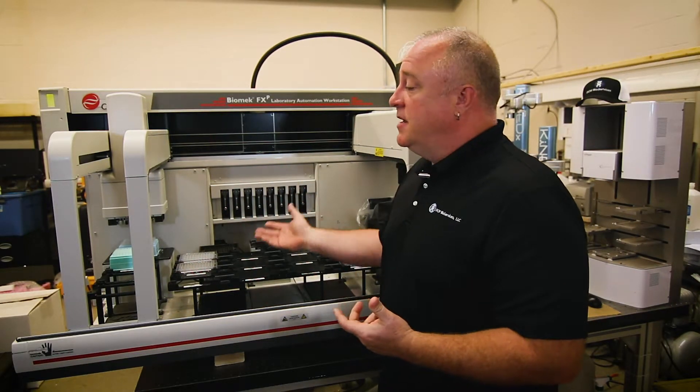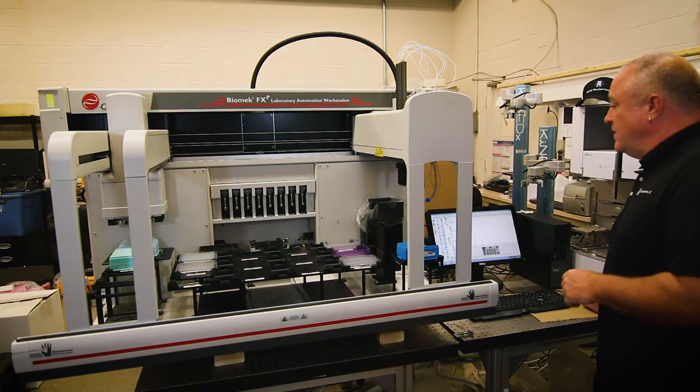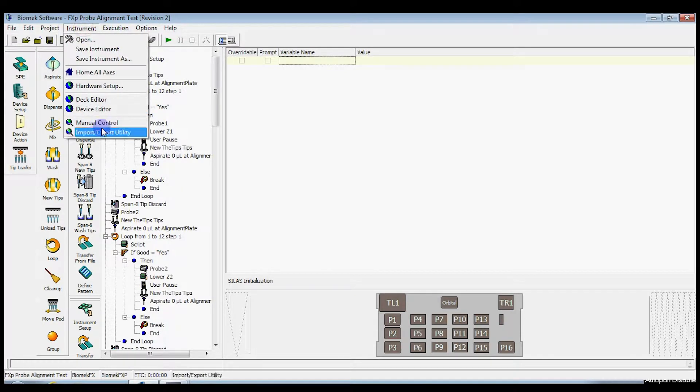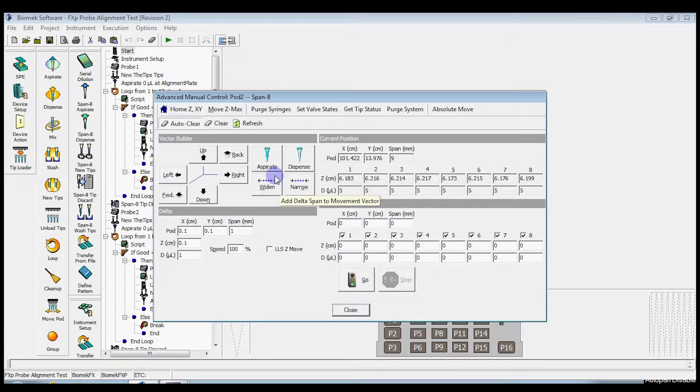If you do see air in the syringes, you can run the purge syringe procedure. Go over to the software, go to Instrument, Manual Control, Advanced Controls, and click on Pod 2 — this is Pod 2, usually the SPAN 8. There are two different purges in here: purge syringes and purge system. They do the same thing, but purge syringes is what you want to do at this point.